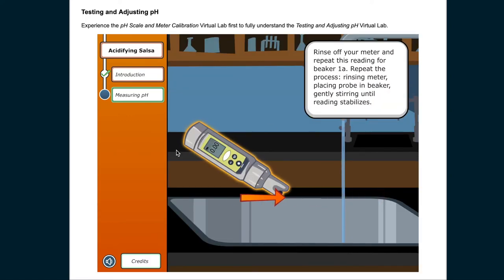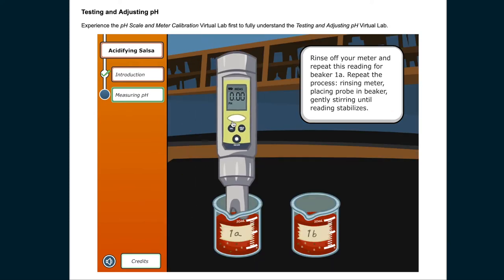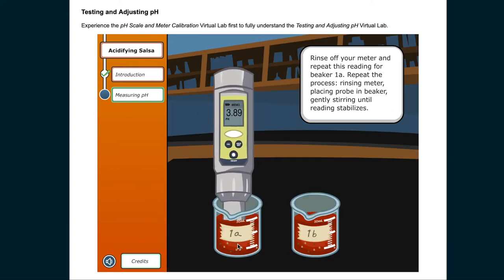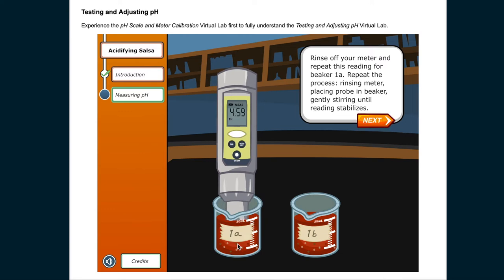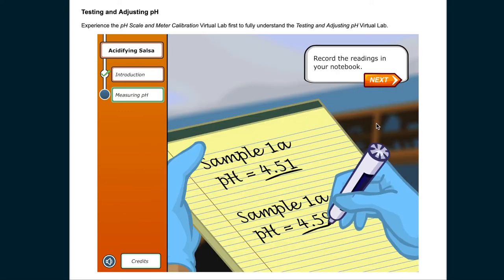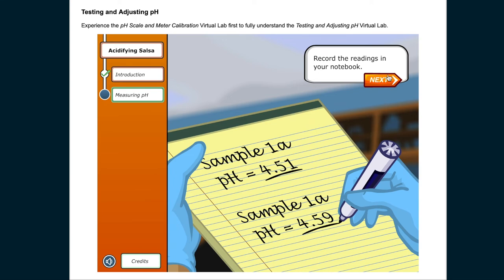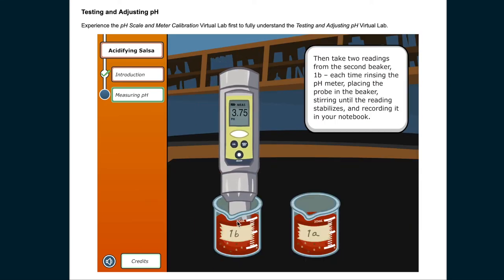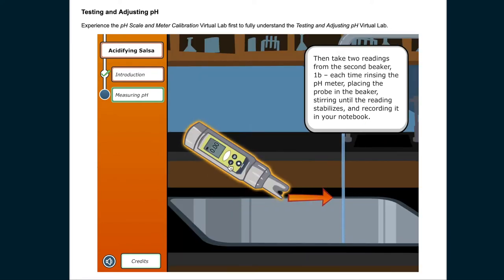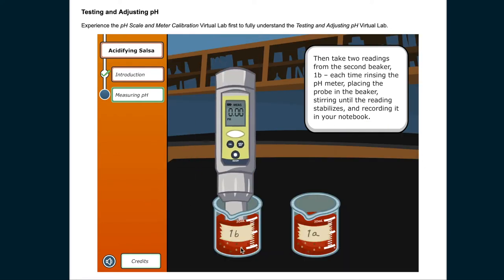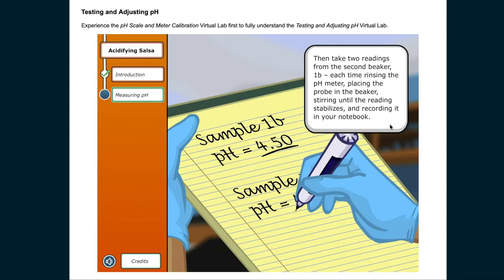Rinse off your meter and repeat this reading for beaker 1A. Repeat the process: rinsing meter, placing probe in beaker, gently stirring until reading stabilizes. Record the readings in your notebook. Then take two readings from the second beaker, 1B. Each time rinsing the pH meter, placing the probe in the beaker, stirring until the reading stabilizes, and recording it in your notebook.